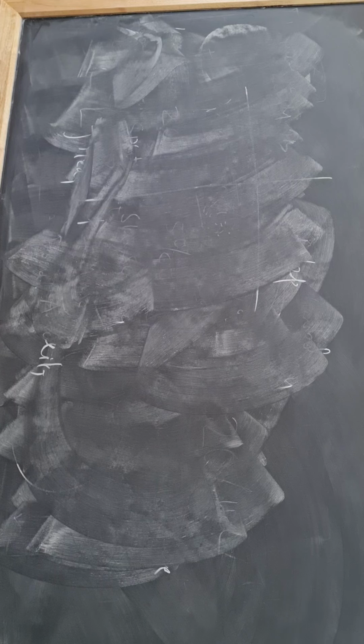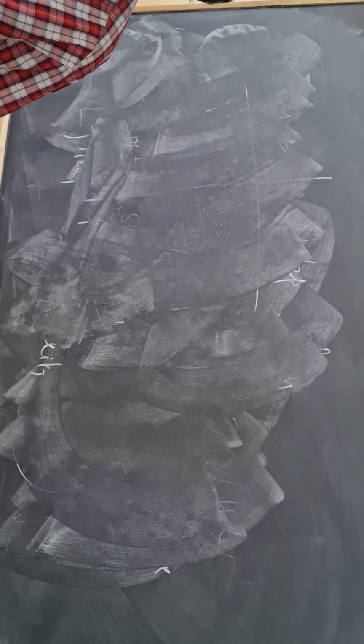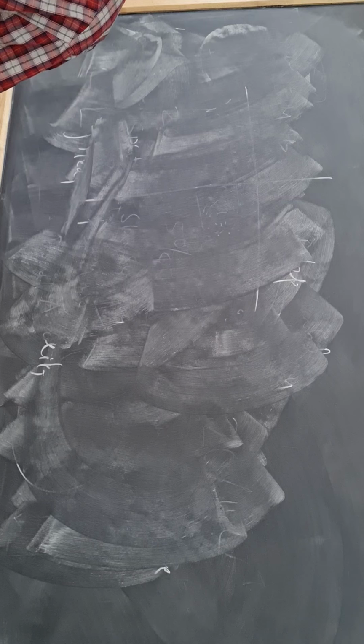Then afterwards wash, and decolorize with 20% hydrochloric or sulfuric acid, drop by drop until a faint color remains. Counter stain with methylene blue for 30 seconds to 1 minute. Wash, blot dry, and see under the oil immersion microscope. So these are the two stains that are given in the examination.